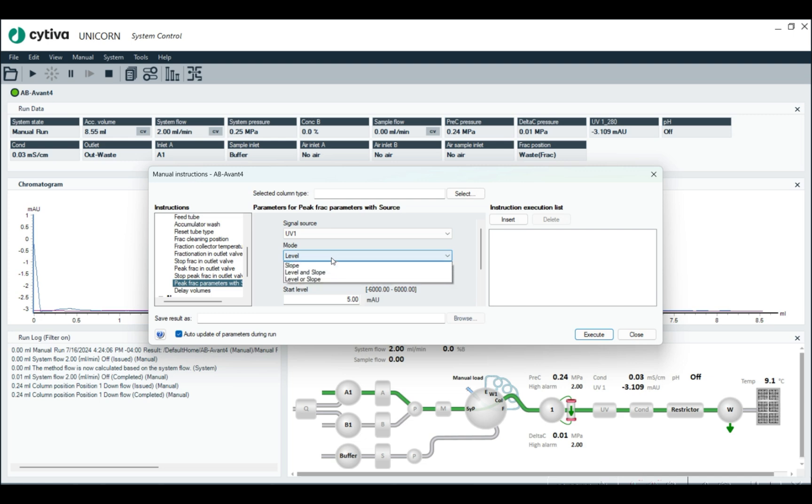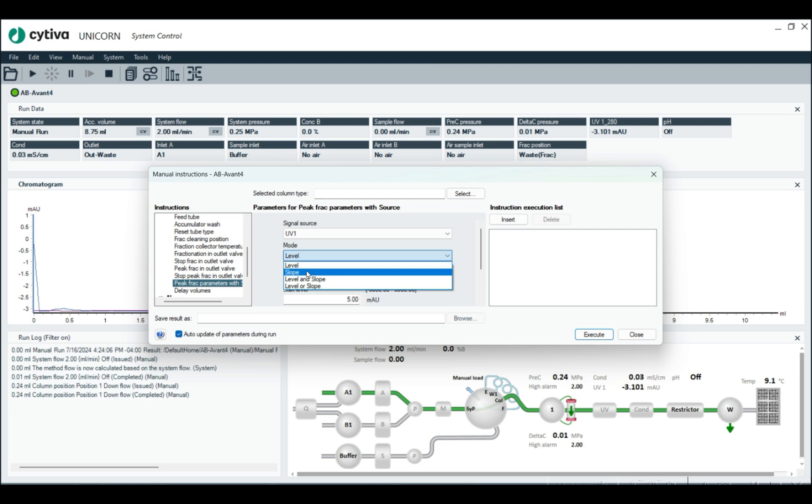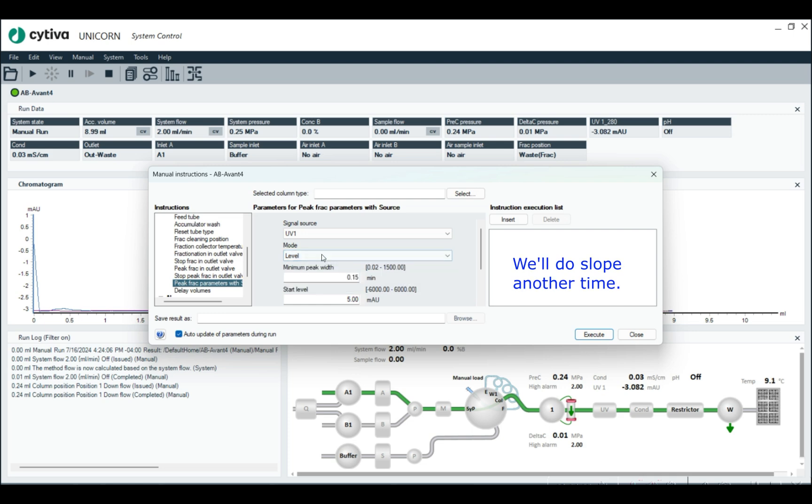And then the mode is level. And so the two choices really here are level or slope. Slope depends on if the curve is going up at a particular degree, and then level is just a threshold that you cross. Level, in my opinion, makes the most intuitive sense.